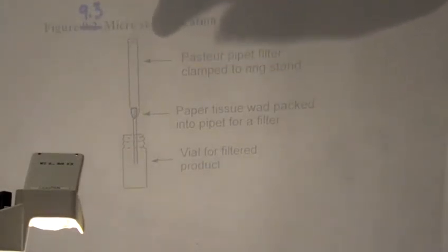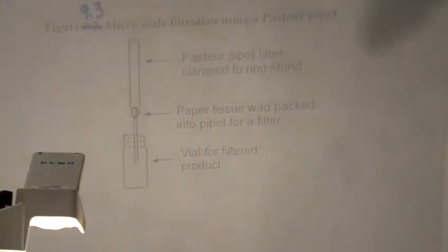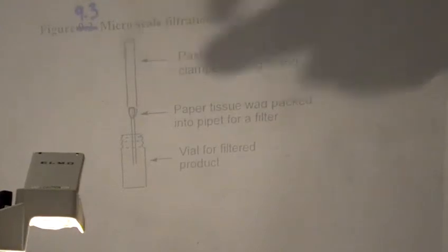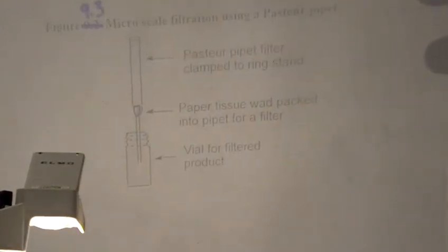So we're going to stick them in that beaker for a little while, get all the fumes off of them before we stick them in the glass waste, otherwise our glass waste will be really stinky, okay? So this is the only reason you have experiment 9 in your lab manual, is for this picture, okay? So that was your contribution from experiment 9.